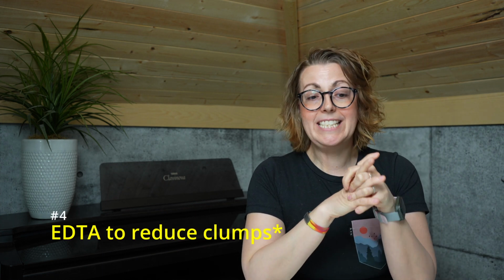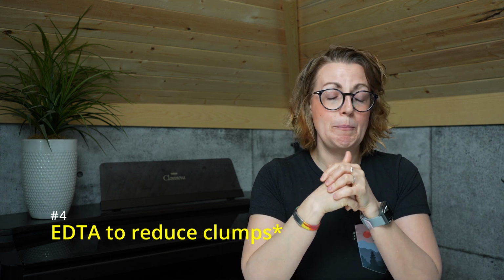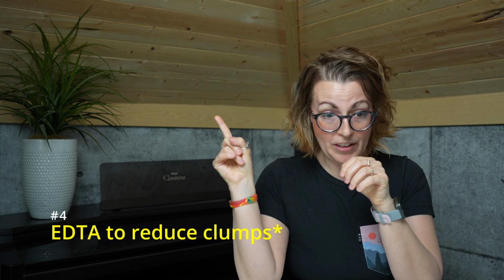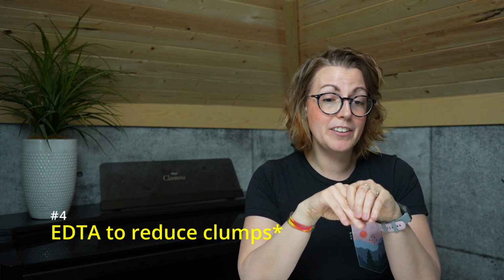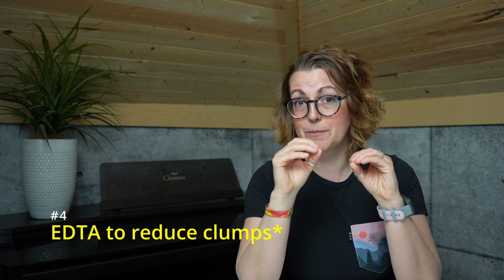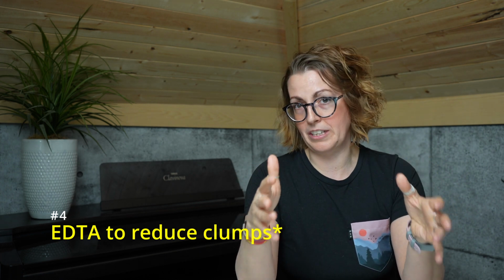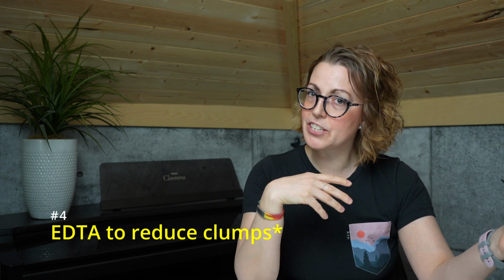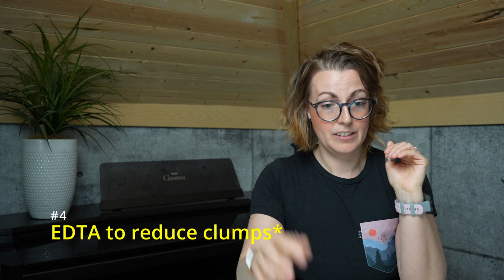Fourth up, EDTA. If you don't know about EDTA, you can check out my video on buffers. I'll link it up in the corner there. EDTA can be used to reduce clumping, and depending on the cells and how they respond to it, this may actually help you keep a single cell suspension during sorting. Again, helping you maintain your single cell sorts, but also helping to prevent clumping.